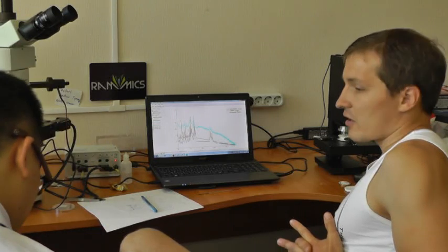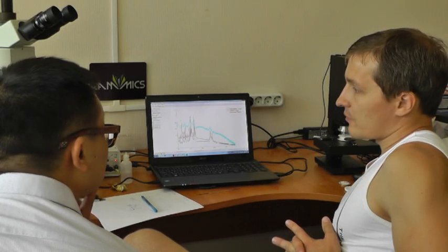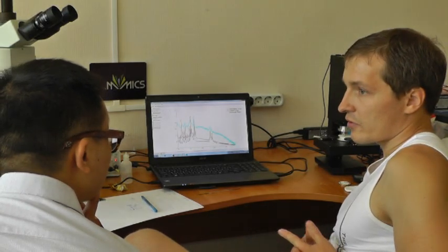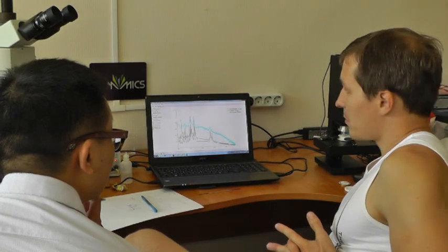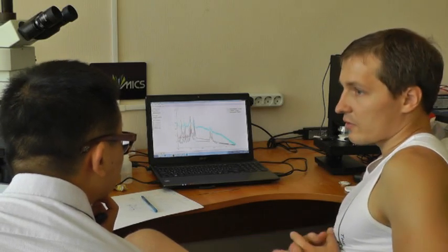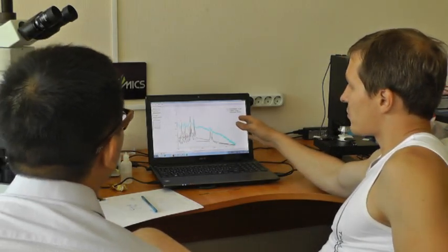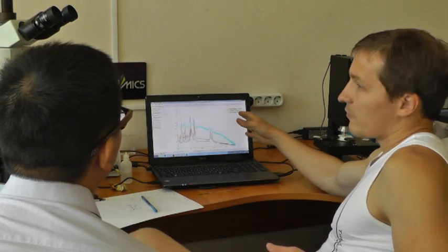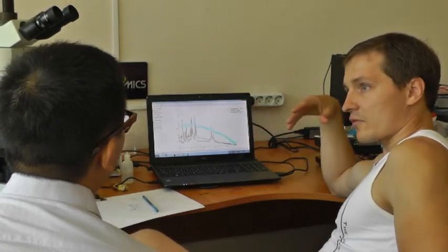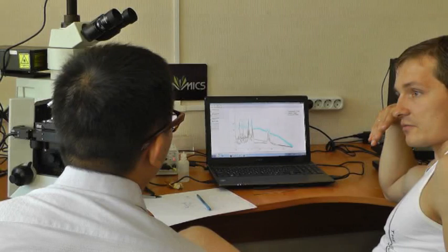Especially if we are searching for trace impurities, very low percentages of impurities, we cannot consider the results as exact, because from 300 spectra, for example, we got just 5 or 6 spectra of caffeine, and the statistical deviation for small numbers is very substantial.